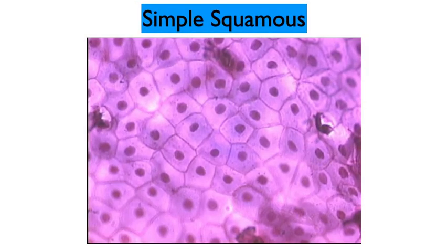So let's start with epithelial tissue. Epithelial tissue commonly is going to line the outside of the body and surfaces inside the body that communicate with the outside, as well as covering the surfaces of organs and the interior cavities of the body, like the pleural cavity or the pericardium or the abdominal cavity. And let's start, therefore, with what are called simple squamous epithelial cells.